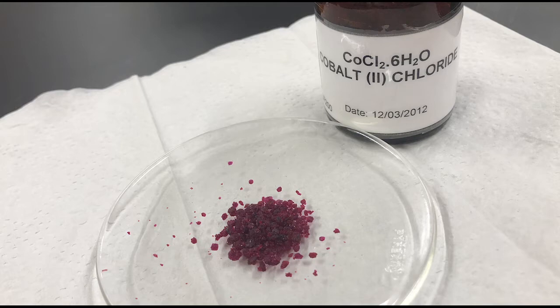As you can see, cobalt-2 chloride hexahydrate is a sort of purplish crystalline solid.